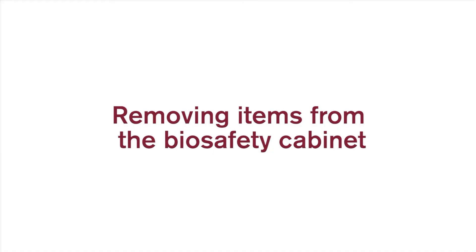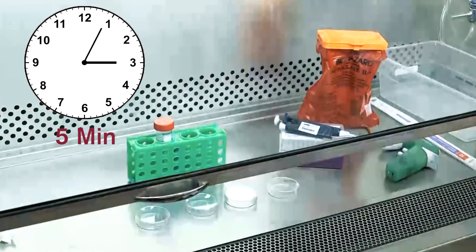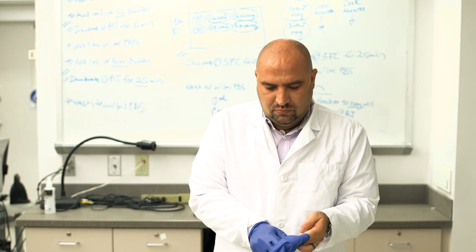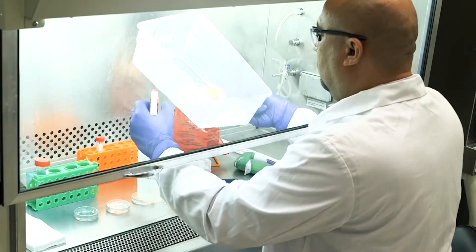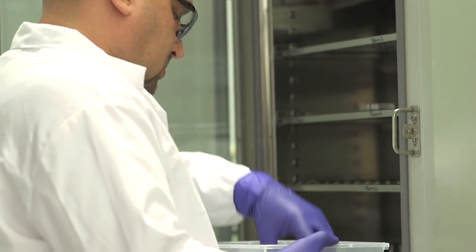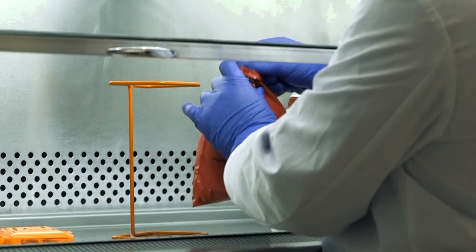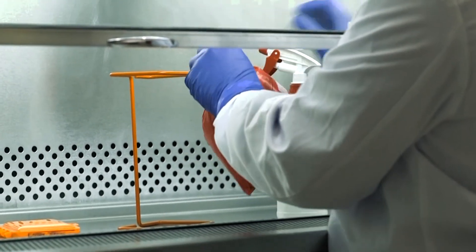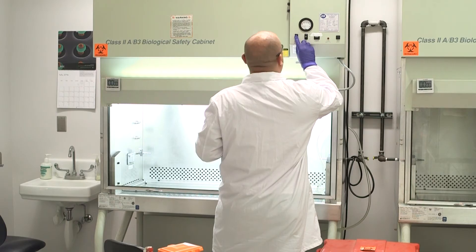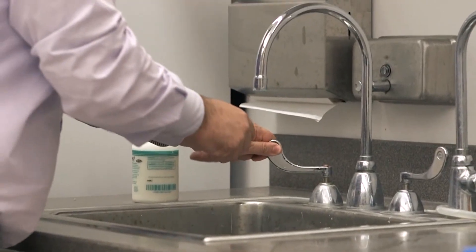Removing items from the biosafety cabinet. Once work inside the biosafety cabinet is completed, wait five minutes to purge air from contaminants before exiting the cabinet and removing items. After exiting, remove your gloves and replace them with a new pair. Surface decontaminate all items inside the biosafety cabinet before removal. First, remove samples that need to be placed in incubators, refrigerators, or freezers. Then remove all other items except for waste. Collect waste in the biohazard bag, close the bag inside the cabinet, and wipe with disinfectant before removal. Disinfect all cabinet surfaces. Turn off the light and the blower. Remove all PPE, dispose of biohazard waste, and wash your hands with soap and water.